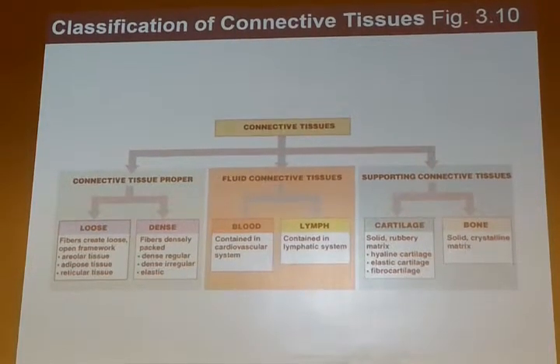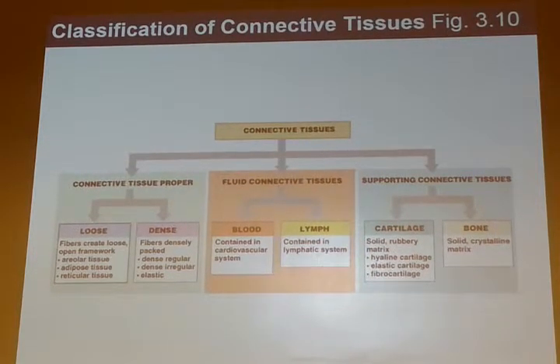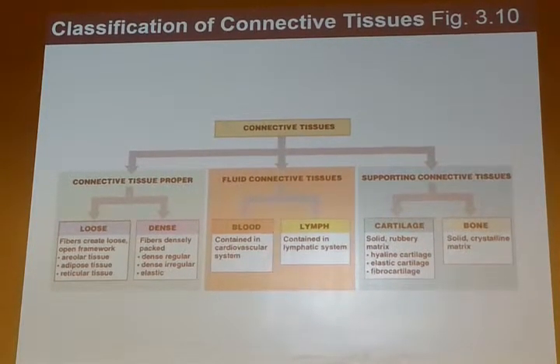Dense, you have dense regular. You put a little tension on those collagen fibers, they're all parallel. All the nuclei are lined up parallel. They're very regularly arranged collagen fibers, and also the nuclei of the fibroblasts that are secreting them that are still in the tissue, very densely packed together.